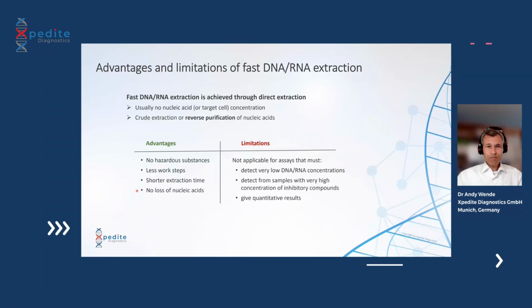On the limitation side, this is basically also shown here. You usually don't have a target concentration possibility with a direct extraction. That's why these fast or direct extractions are not always applicable for testing when you want to test for very low DNA or RNA amounts.